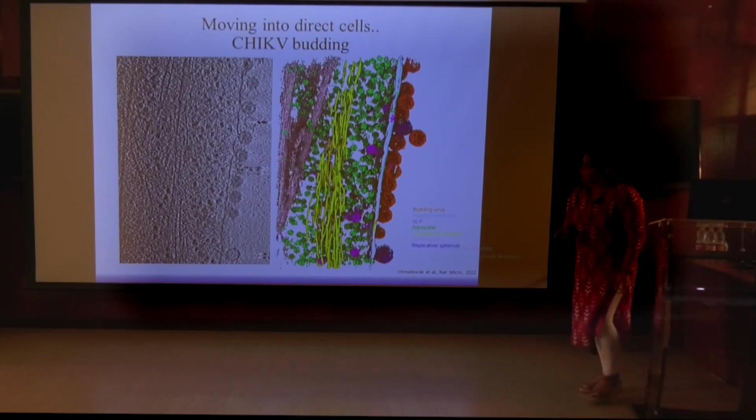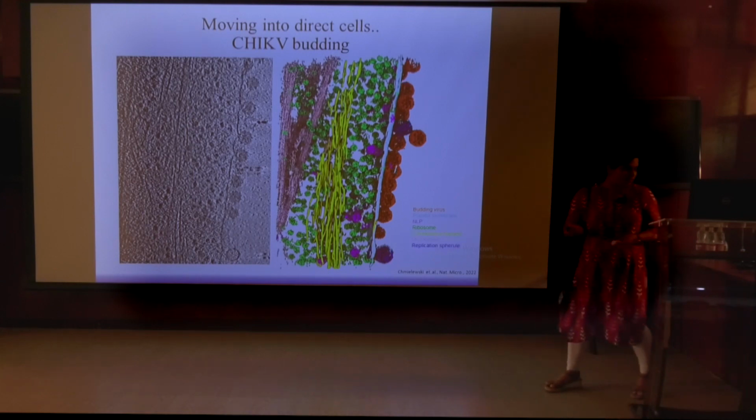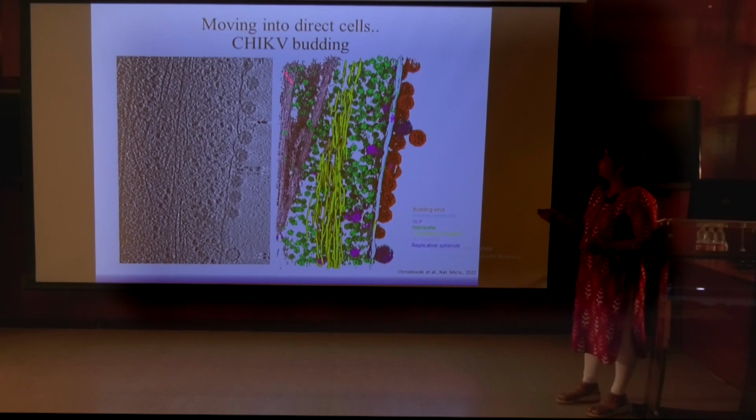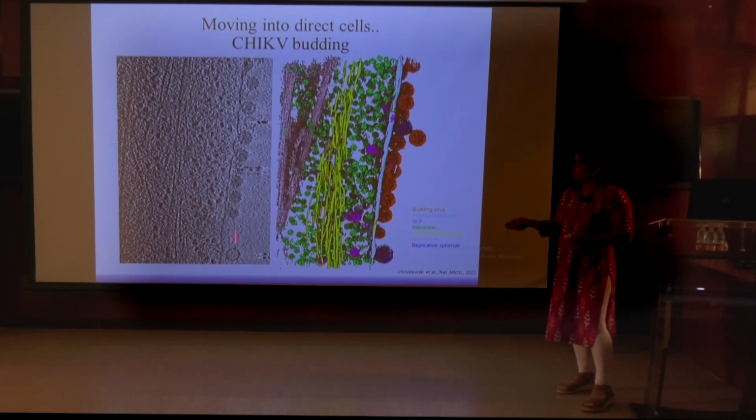Anyway, so moving on, along the time when I published this work on the chikungunya virus with liposomes, by that time people were also looking at these viruses in terms of the whole cell, in terms of how they infect, because now we have the technologies to actually look at direct cells and how they interact.